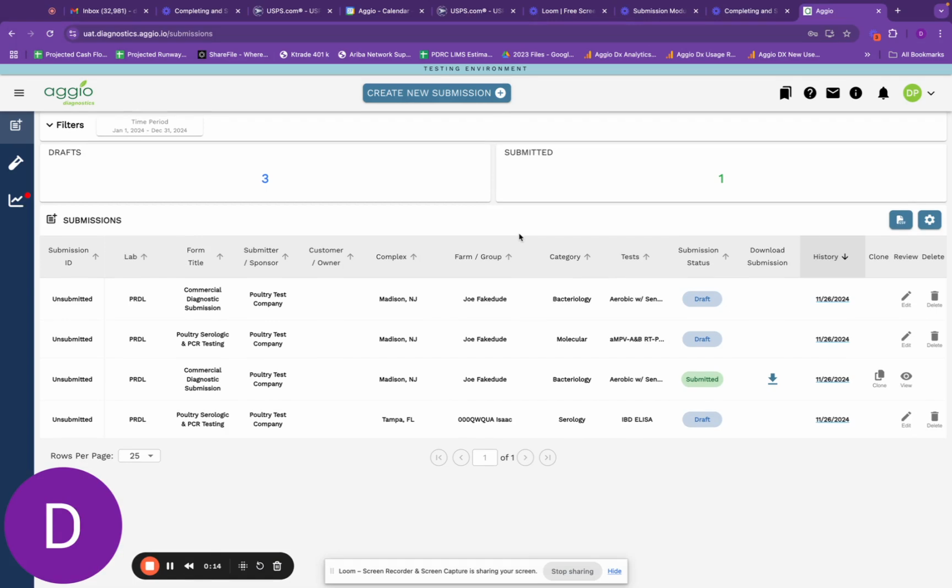In this video, we'll guide you through the process of completing and submitting a sample diagnostics form using our platform. By following these steps, you ensure accurate and timely results from the lab. The submission process is simple and intuitive.